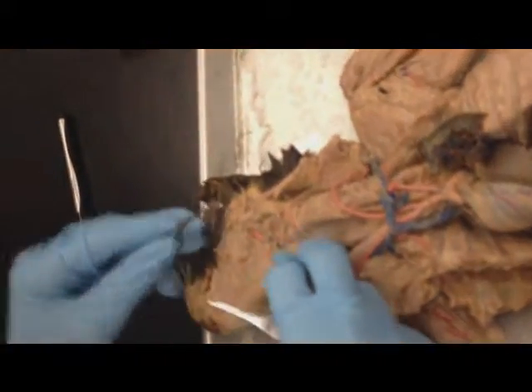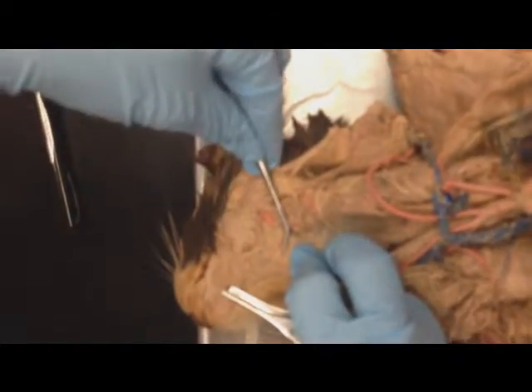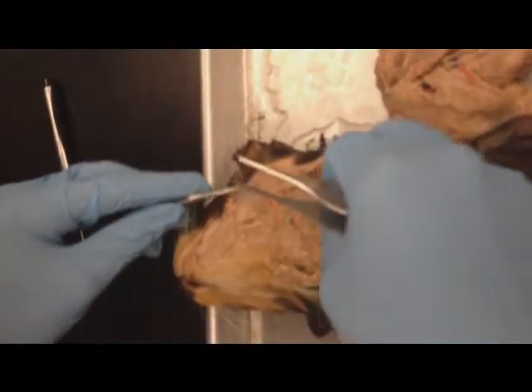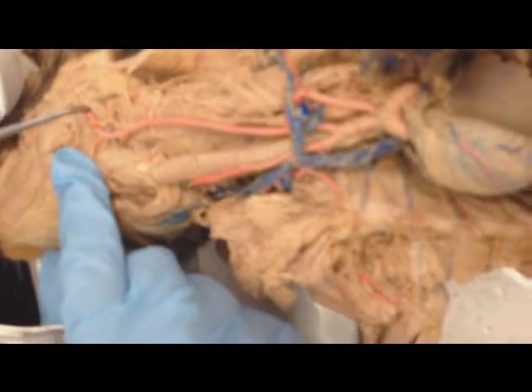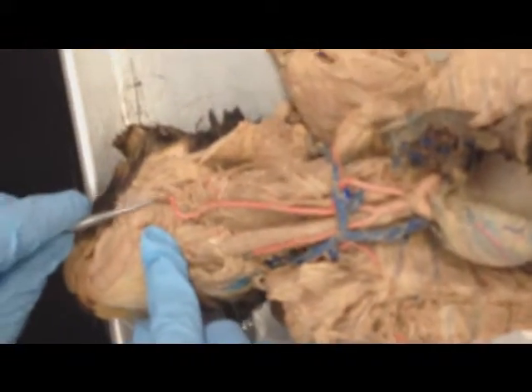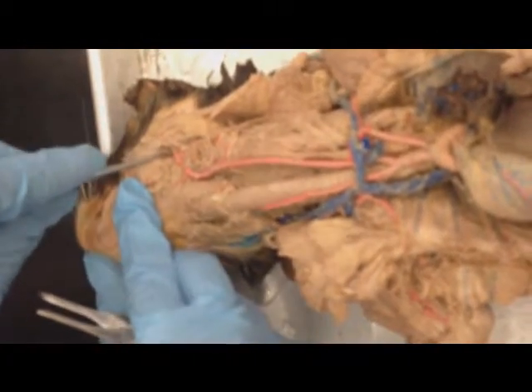Into the cat's neck, you see here the artery that goes toward the tongue. It's called lingual. Into the neck, often you'll see off of the common carotid, whether it's right or left, an external common carotid, which will go in here, and branching off of the external carotid is the external maxillary.